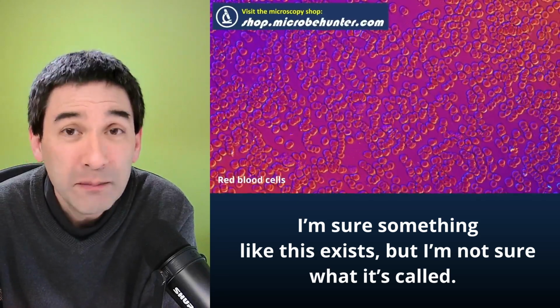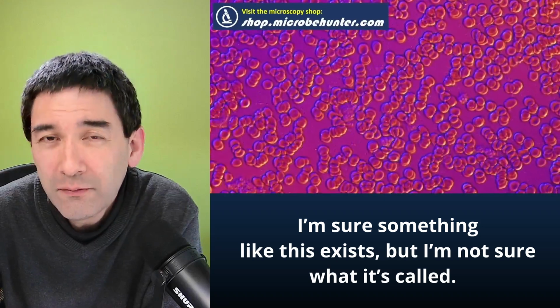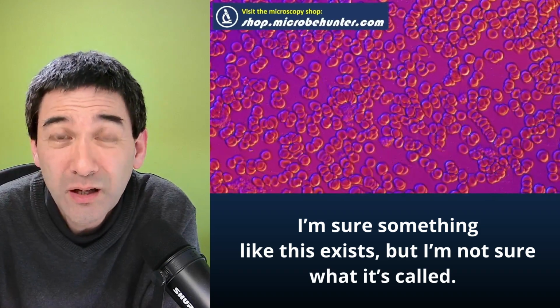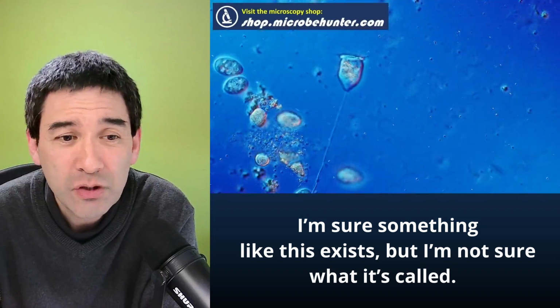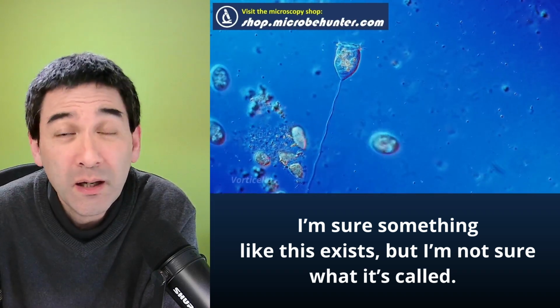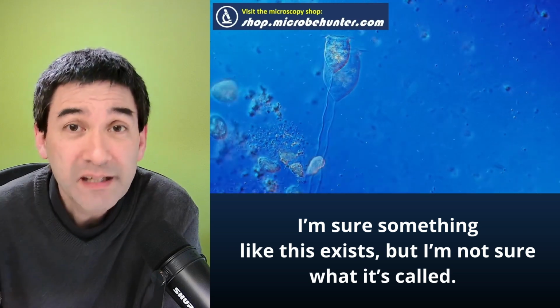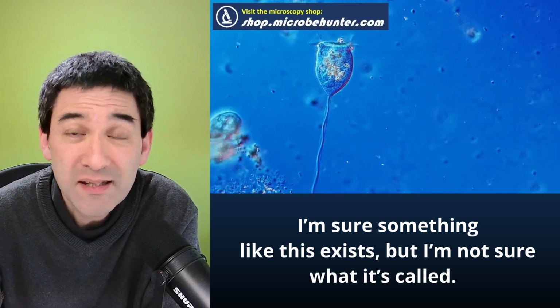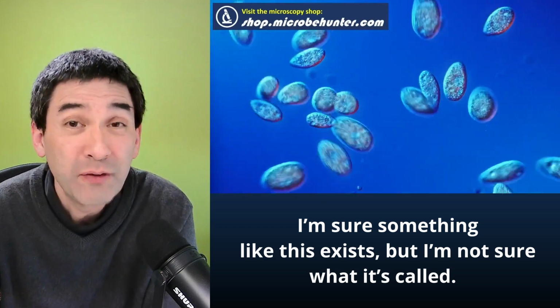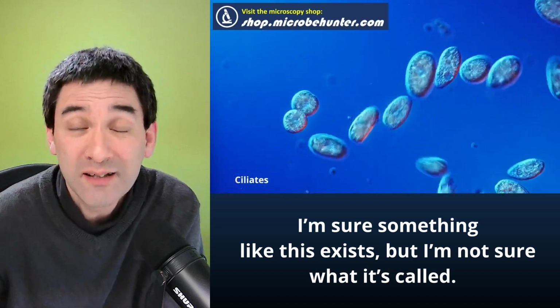But for light microscopes, I'm not aware of anything like that, because essentially the objective itself would then have to be sealed airtight around the specimen, and this is actually not something that is normally done. And why would one do that? The air basically does interfere because of a refractive index, but it's basically the same as the refractive index of a vacuum. So concerning refractive index, there's not really a huge difference. And honestly, the microscope objectives are already designed to take this into consideration.